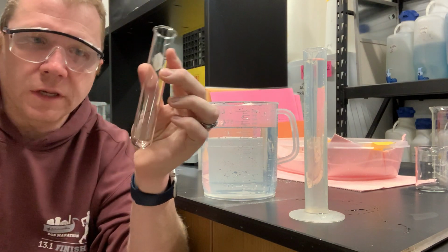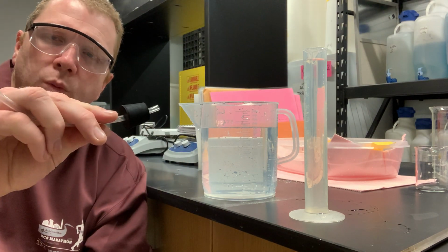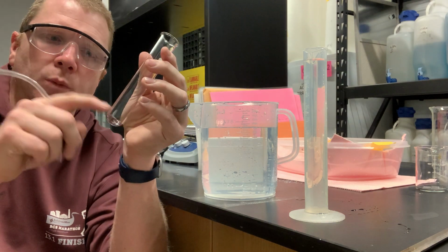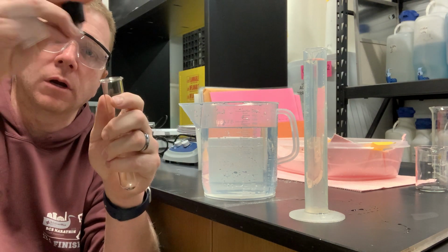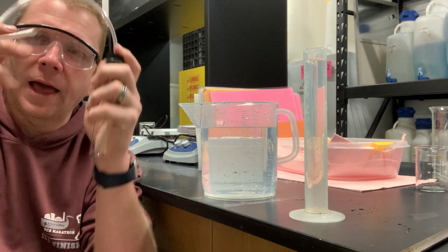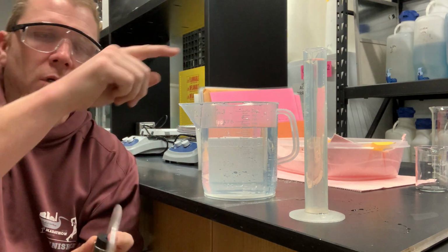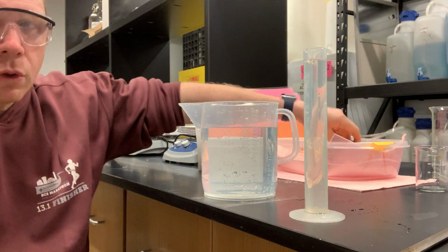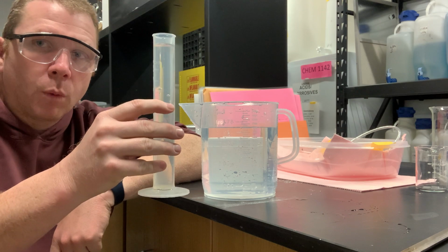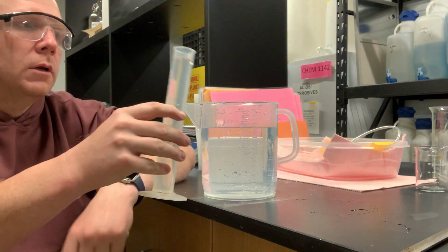Now, the other components of my apparatus are this test tube and this rubber stopper with tubing threaded through it. What we're going to be doing is carrying out our reaction in here, putting this cap on, and capturing the gas that is produced in this reaction in our grad cylinder. So in order to do that, we need to invert our 100 mil graduated cylinder.